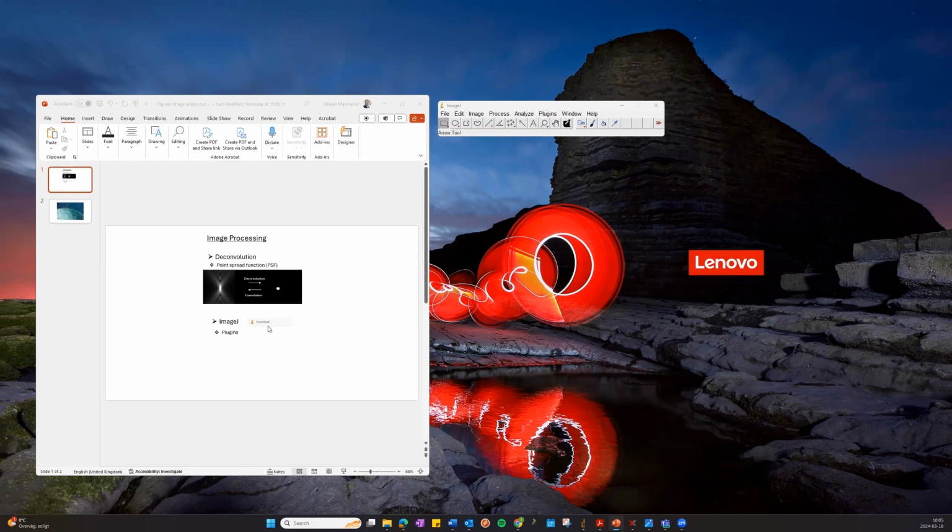That means that for MolBoolean analysis, three different PSF images will have to be generated: the PSF Atto 565, the PSF Atto 647N, and PSF Hoechst 33342. That's the nuclear counterstain that we used in our example, but you can also use DAPI in the nuclei.